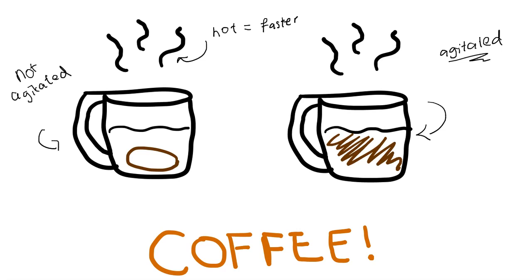the water. So for the first question, the first 3 that were not agitated, think about this. The first 3 that were not agitated at all, like you didn't touch them, you didn't stir them, you didn't move the place around. What happens? Even just thinking about it, and not even doing it, but just thinking about it chemistry-wise, nothing's going to happen. It's going to take a long time for it to dissolve. In the hot water, it actually does go a lot faster.